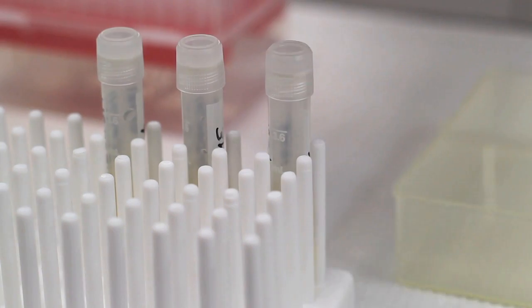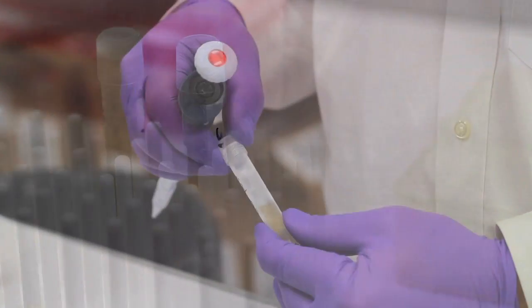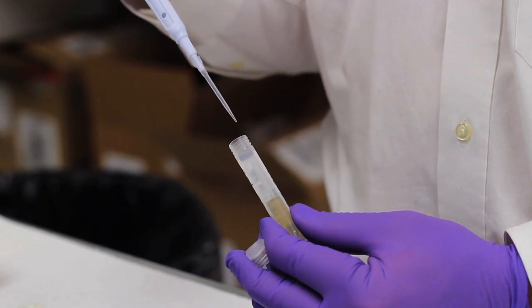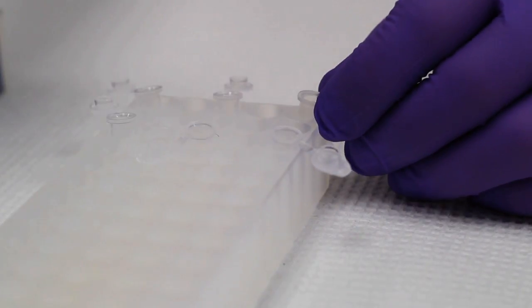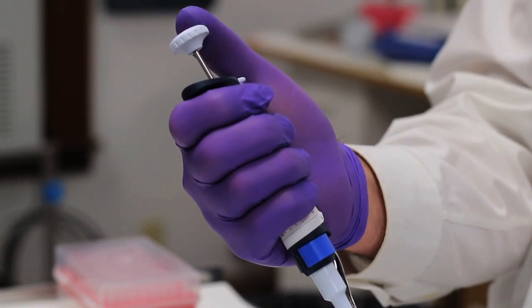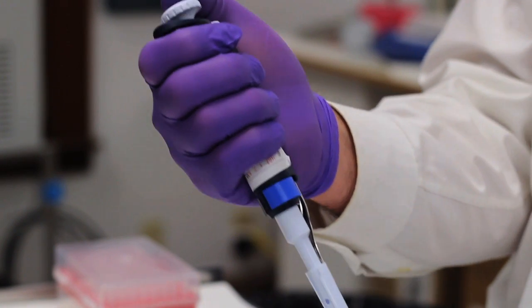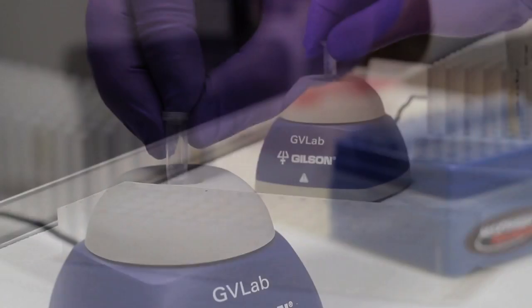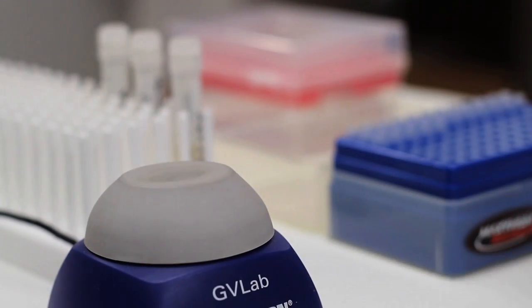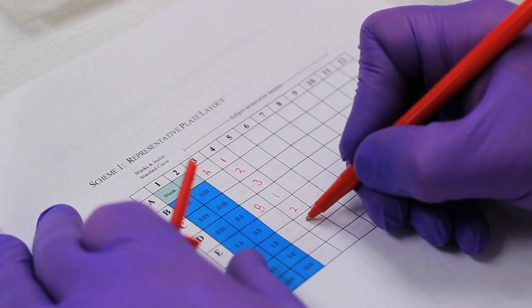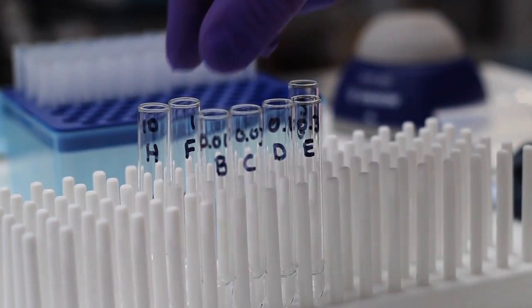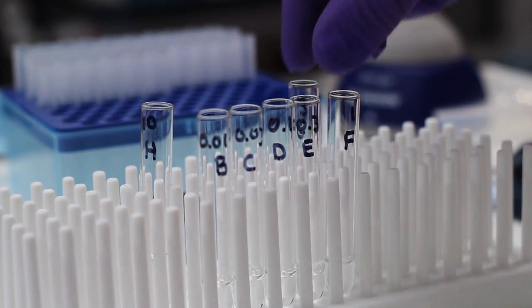Overall, this analytical method provides flexibility in terms of experimental design, given that the dilution level is directly proportional to the dose. Researchers are free to vary these parameters to meet the objectives of the study. Be aware that different species will have different normal rates of clearance, and as a result, the required dose and dilution can vary. Therefore, Biopal strongly advises researchers to perform a pilot study to determine the ideal dose and dilution range for their experimental model.